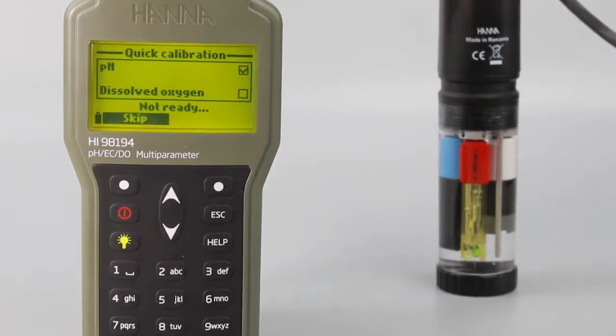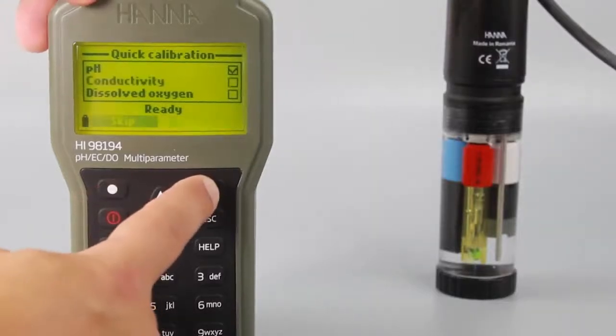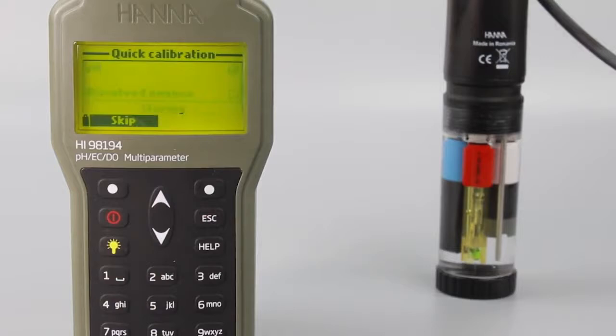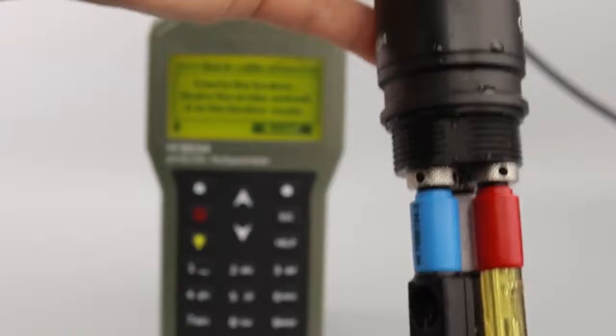Once you get to the dissolved oxygen calibration, you'll be prompted to empty the beaker. Unscrew the calibration beaker and empty the solution.